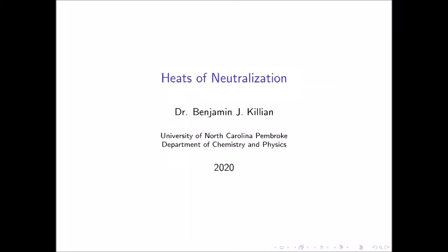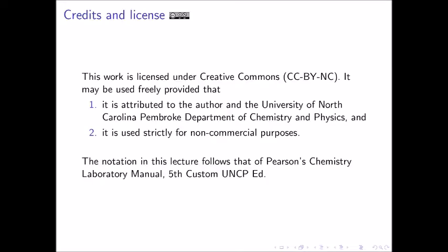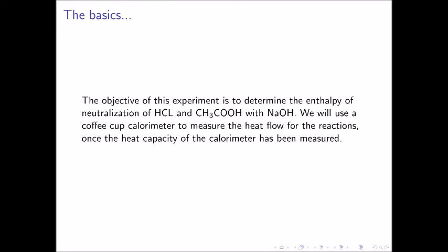In this experiment, we will be determining the heats of neutralization for two different acid-base reactions. The objective of this experiment is to determine the enthalpy of neutralization of hydrochloric acid and acetic acid with sodium hydroxide. We will use a coffee cup calorimeter to measure the heat flow for the reactions, once the heat capacity of the calorimeter has been measured.